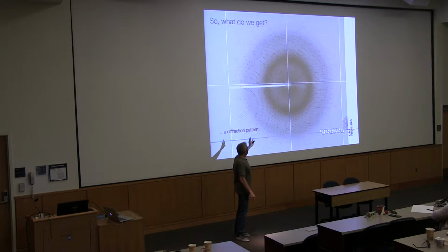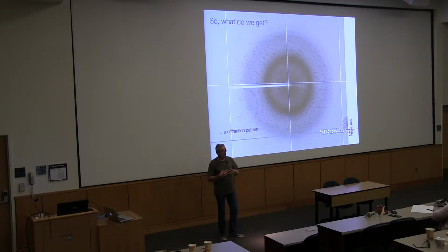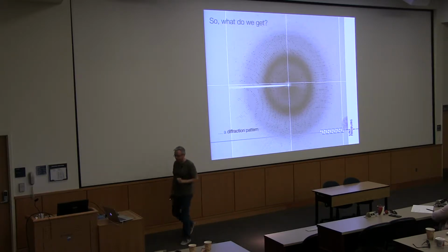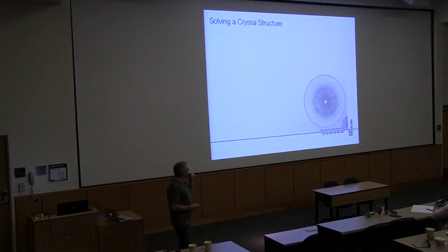And we need to measure all these little black spots, and in the first crystal structures, they were actually measured by hand. In order to get all the data we need to solve a structure. And actually, that's not even all the data I'll show you. Okay, so we need to count and measure black little dots. It's kind of the most exciting type of science you can do, but you don't have to do it by hand anymore.